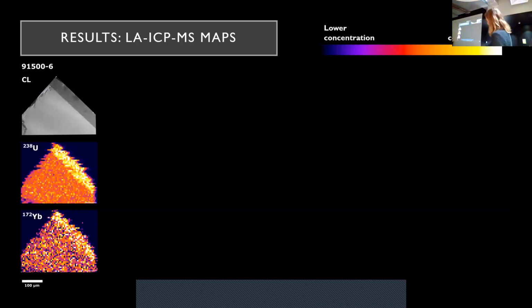All right. The detailed data is gone, the graphs are out. Now we can look at some pretty pictures of zircons, which is great. I'm going to show you the laser ablation geochemical maps, and then I'll show you the TOF-SIMS geochemical maps. So again, I have this 91500 crystal. Across the board, it was the most homogeneous. I'm showing you the one that had the biggest zone in it, I guess. The one with really the only zone.